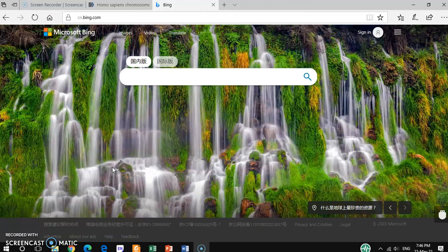So in this tutorial video I'll show you how to make a 3D structure of a protein. Normally you can get any 3D structure or model from PDB. There are a lot of proteins available in PDB, but if the protein you require is not available, and you have the linear sequence of the protein, you can use this linear sequence to get a 3D structure of the protein by using the online Swiss Model.